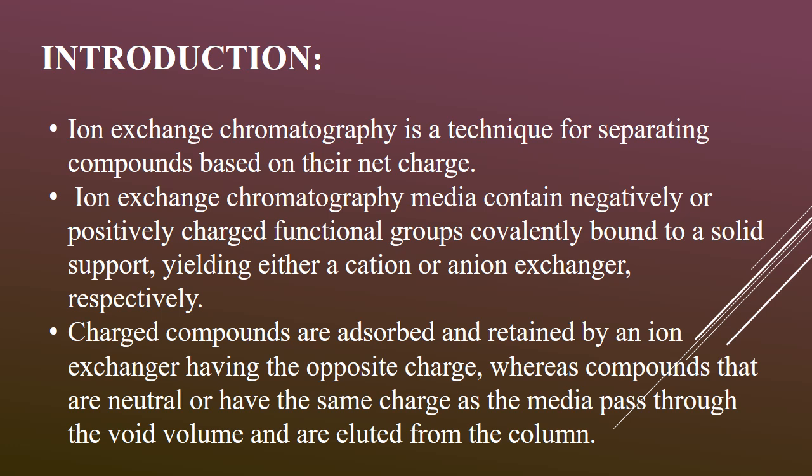Ion exchange chromatography is a technique for separating compounds based on their net charge. Ion exchange chromatography media contains negatively or positively charged functional groups covalently bound to a solid support, yielding either a cation or an anion exchanger respectively. Charged compounds are adsorbed and retained by an ion exchanger having the opposite charge, whereas compounds that are neutral or have the same charge as the media pass through the void volume and are eluted from the column.